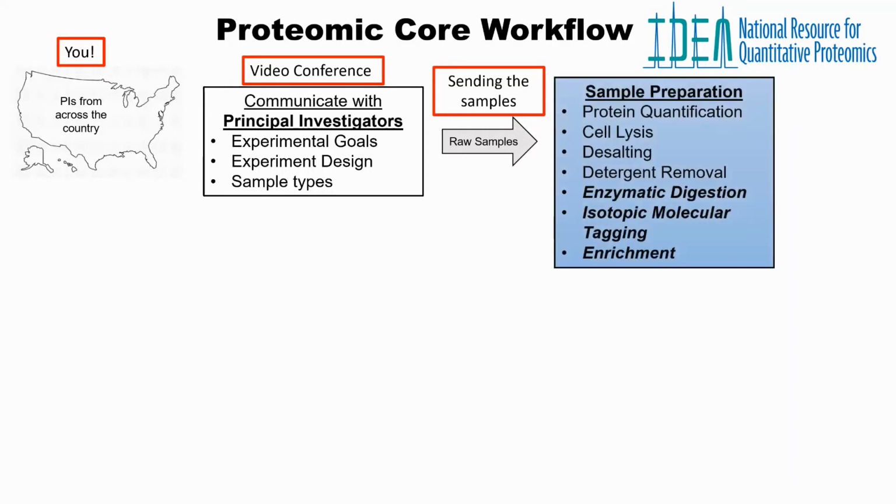The following steps are all done at the core. We can do sample preparation, which includes protein quantification, cell lysis, desalting, some limited detergent removal, as well as enzymatically digest your samples. And if needed, we can do isotopic molecular tagging or enrichment.